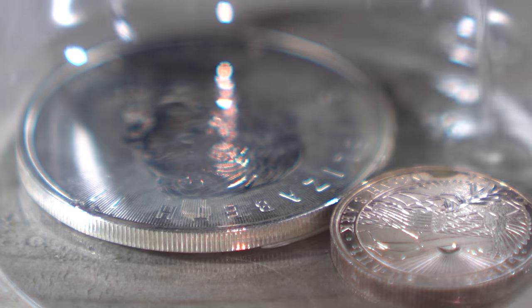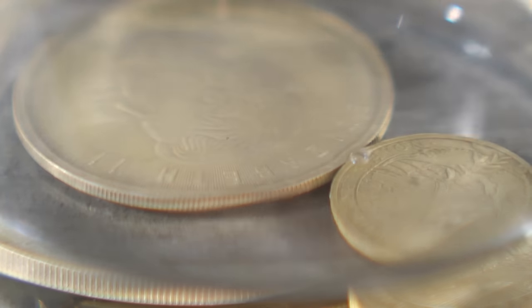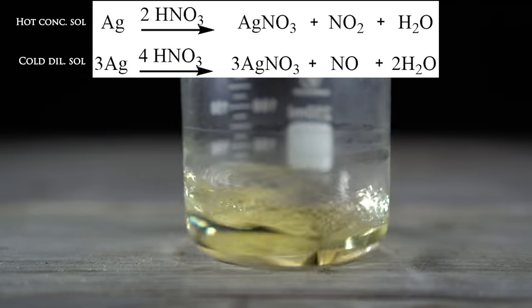Upon the addition of the nitric acid, the silver turns and tarnishes into more of a yellowish color. What's happening is the silver is reacting with the nitric acid to produce silver nitrate, nitric oxide, nitrogen dioxide, and water.